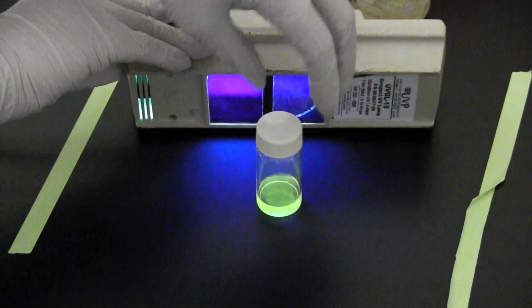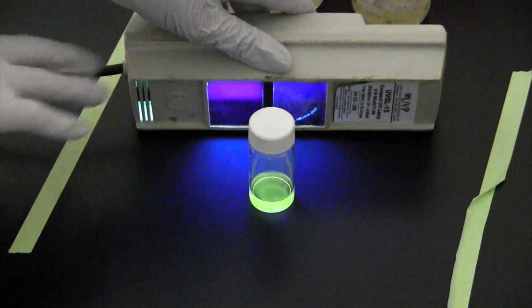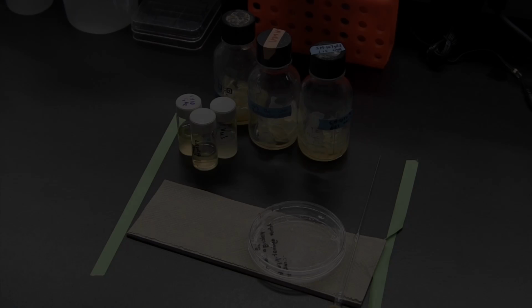So a lot of the molecules become activated. You could have greens and yellows and purples and blues. And it's a really great visual way to show the diversity, even though your extract is this clear liquid, that you might have some really different compounds in that extract.